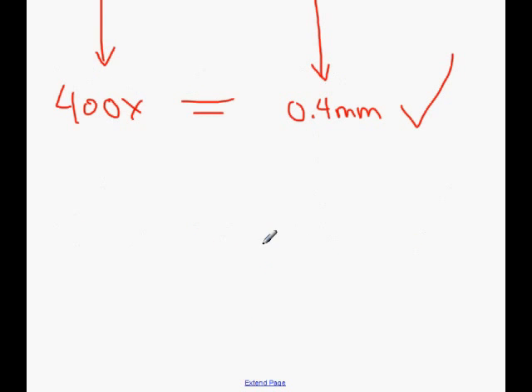Okay. Then you looked at the cells under the high power. Let's suppose the cell kind of looked like that, a round circle, and there's the nucleus. We said, okay, how many cells, and I'm going to ballpark it, do I think it would take to cover the whole field there? If that's the size of 1, maybe that'd be 1, maybe that'd be 1. So I'm going to say on this one, maybe 4 cells, right? Okay, 4 cells.